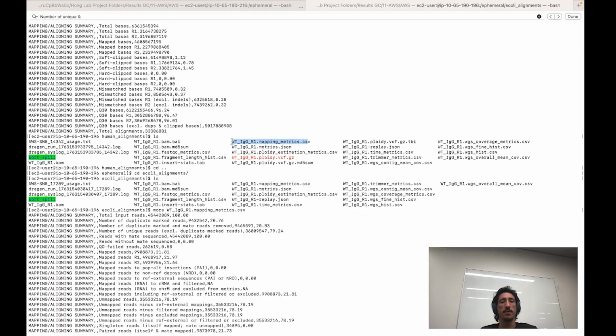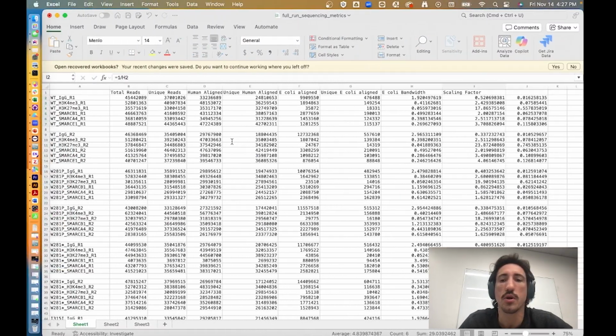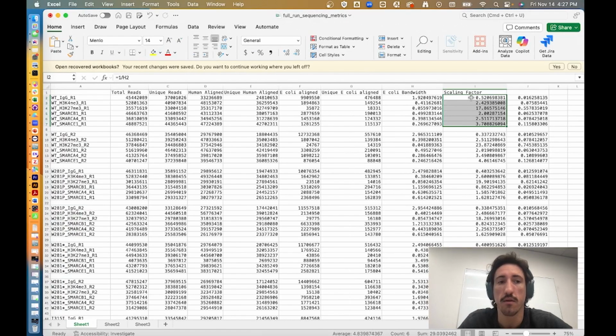And so that's pretty much the end of the alignment video. And in future videos, I'll show you how you actually use this scaling factor to multiply different files and ultimately perform peak calling and graphical visualization.